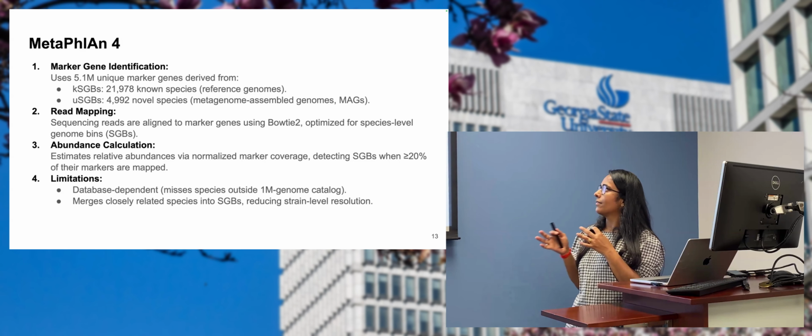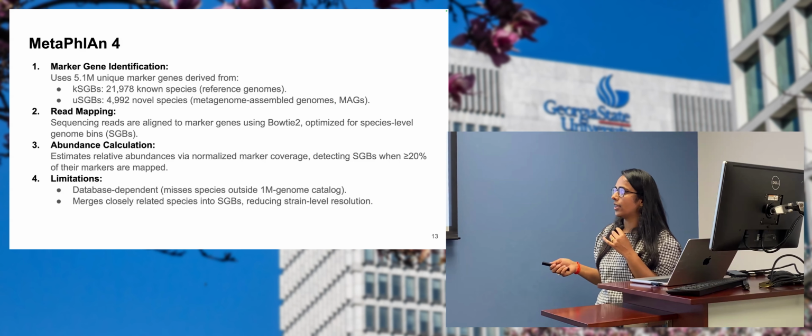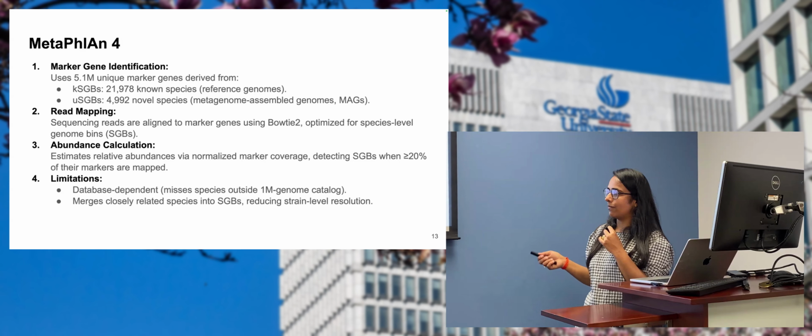Our genomic data that are mapped to this data set we mark down, and we get the abundance using read mapping.